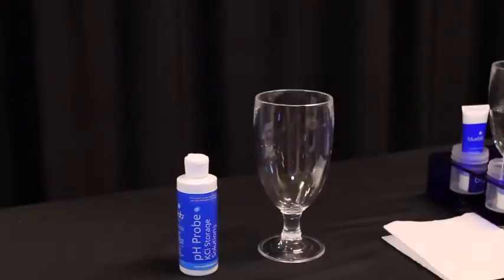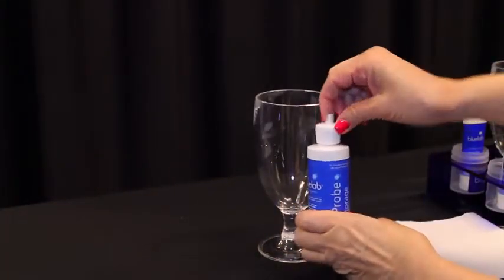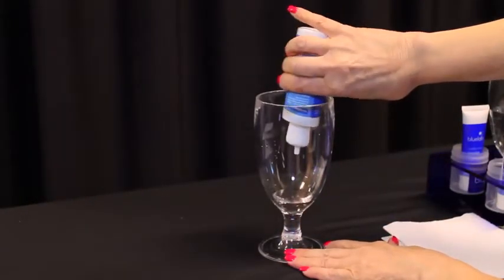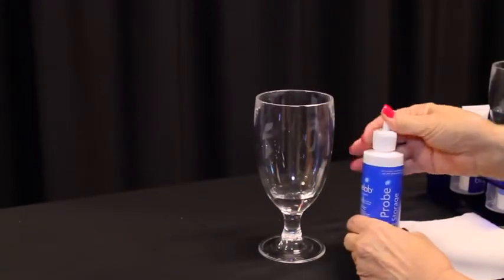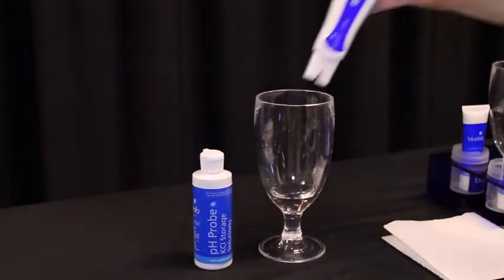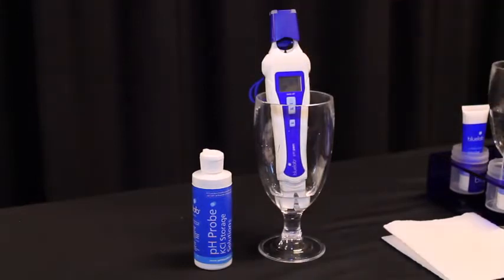You'll need to hydrate the pH pen before its first use. Fill a plastic container with Bluelab pH Probe KCL storage solution so the pH probe tip will be fully submerged. Place the pH pen upright in the plastic cup and leave to soak for 24 hours. This will ensure that the wick is completely hydrated.